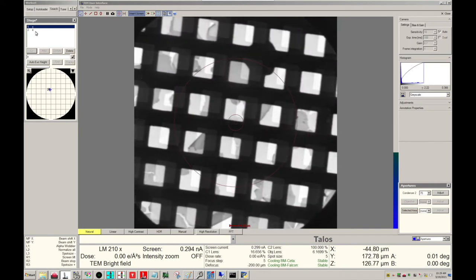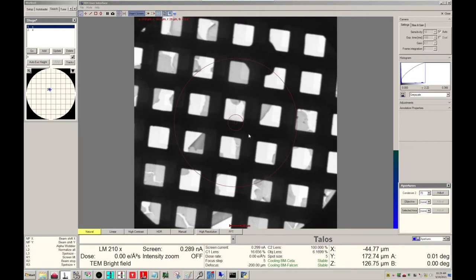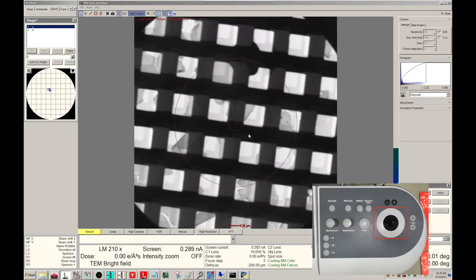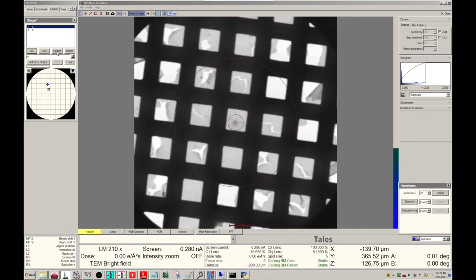Due to multiple loadings and unloadings, the orientation of the cross-grating grid may shift. So let's find a fully intact Carbon square using Stage Movement. And now let's update that location.